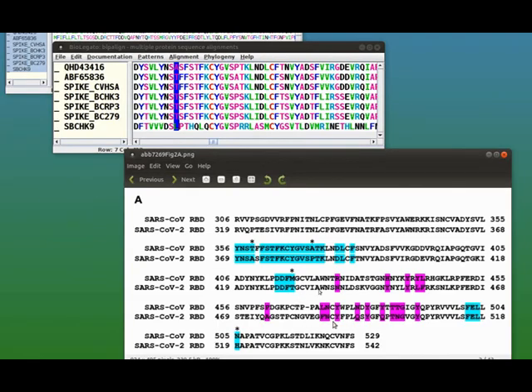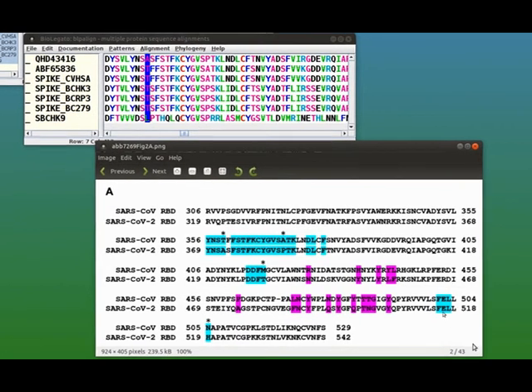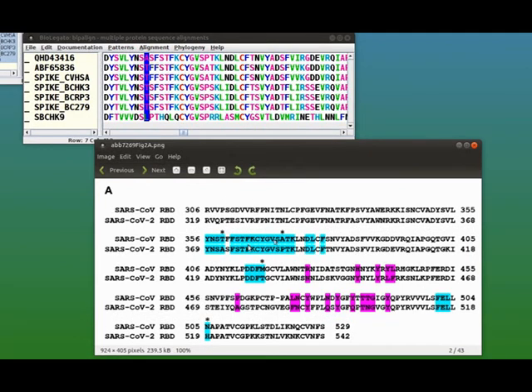Yuan and co-workers demonstrated that the antibody binds to the cyan-colored regions in this protein, and you'll see that there are 4 asterisks which indicate the sites that are polymorphic between the SARS-CoV 2007 protein and the 2020 protein for SARS-CoV-2. Let's go to the first of those sites. So here once again we have the 2020 protein with an alanine, and all the rest of them except for a very distant bat sequence have a threonine at this position.